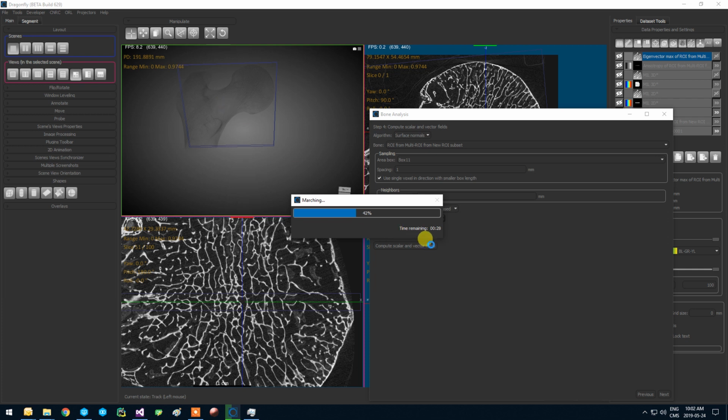So it's performing the same steps. I will not go into the details of how to interpret these fields, but this tool is made so that the anisotropy is evaluated locally, and we have found it is an intrinsic property that is local in the bone. At some places the bone is disrupted, we have the growth plate, and there are some locations where the orientation is very much aligned with the structure. At some other place it goes radial. So it's very interesting to look at this mapping, and I hope this will bring much more understanding to this structure.